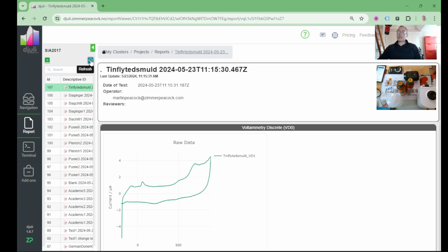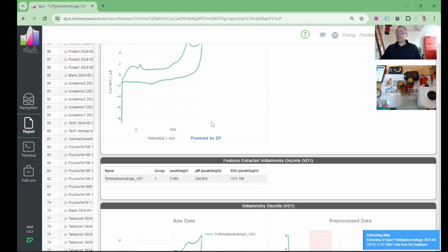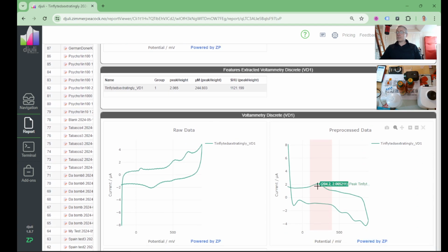it'll bring up the most recent measurement, which is here. Let me just bring that up. Yeah, it's more intense, and then I can see the signal now. So this is 1,121 Scoville heat units. It's written here, and I also get a more intense sort of peak here.